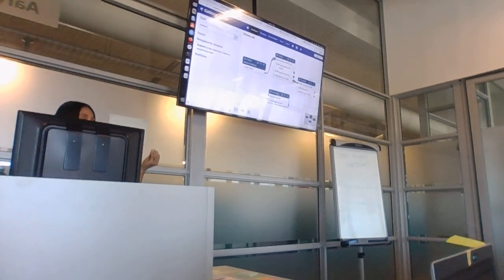In our case, this is just an example because remember we saw previously that we couldn't put the paired collection into Kraken, right? So this is just to show you how you would do it.